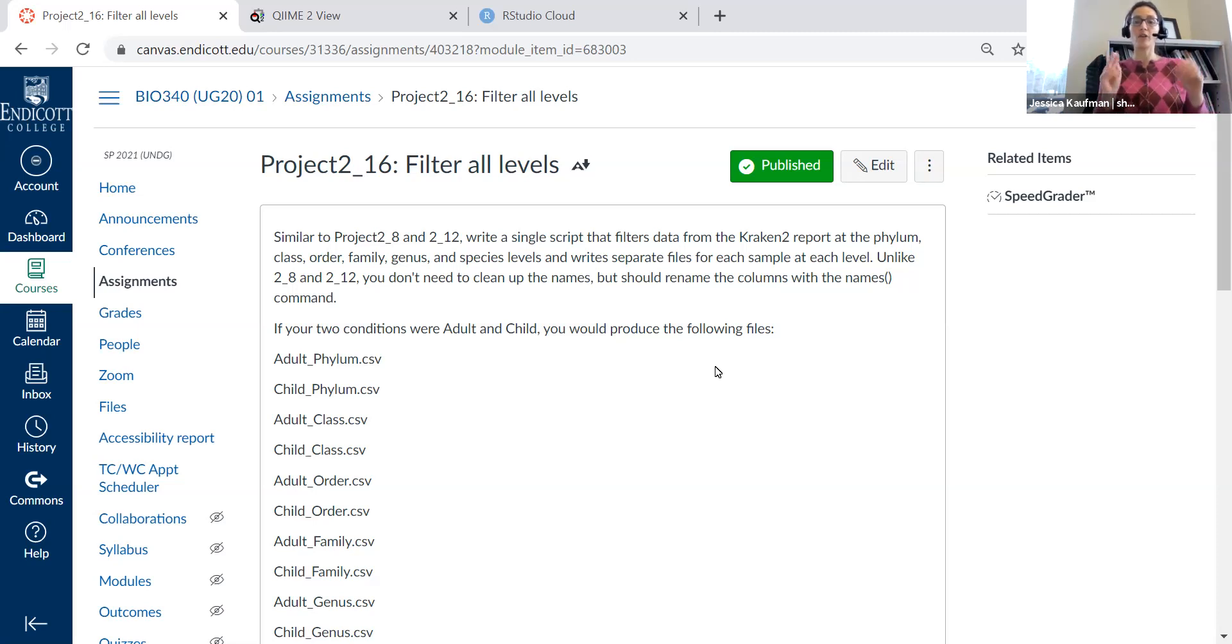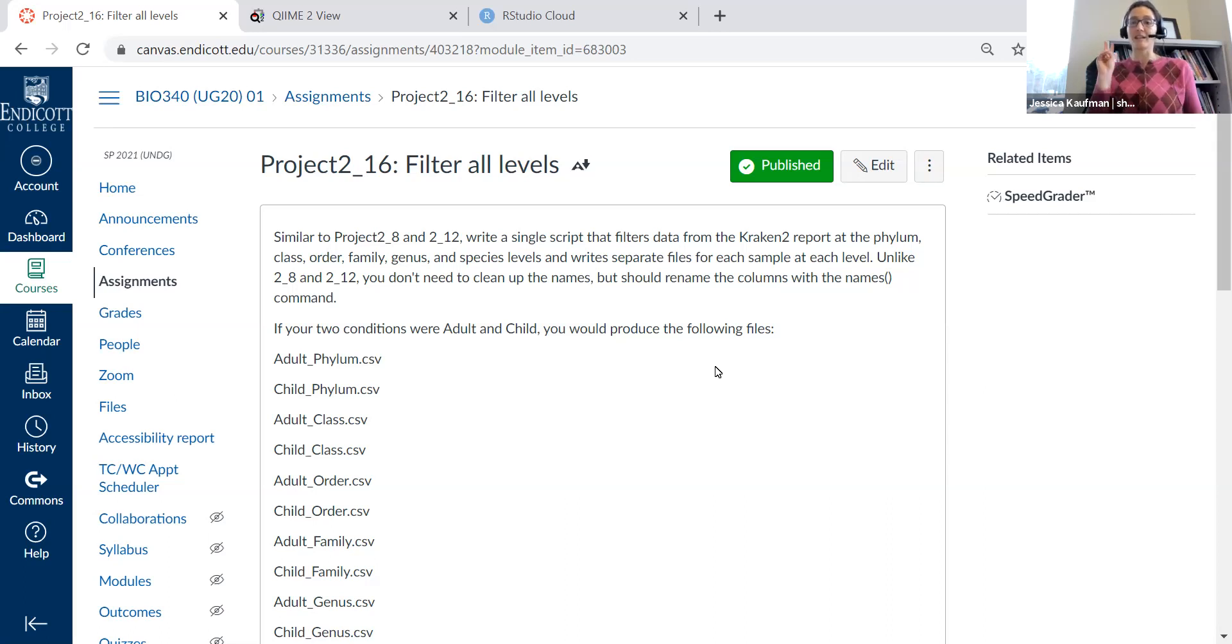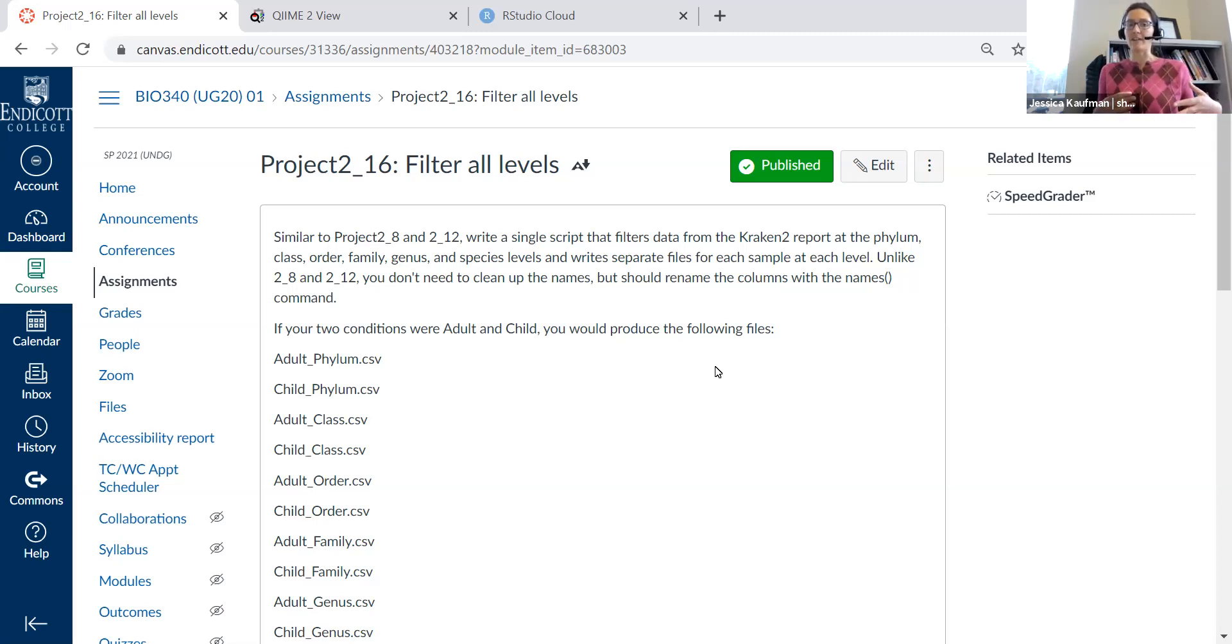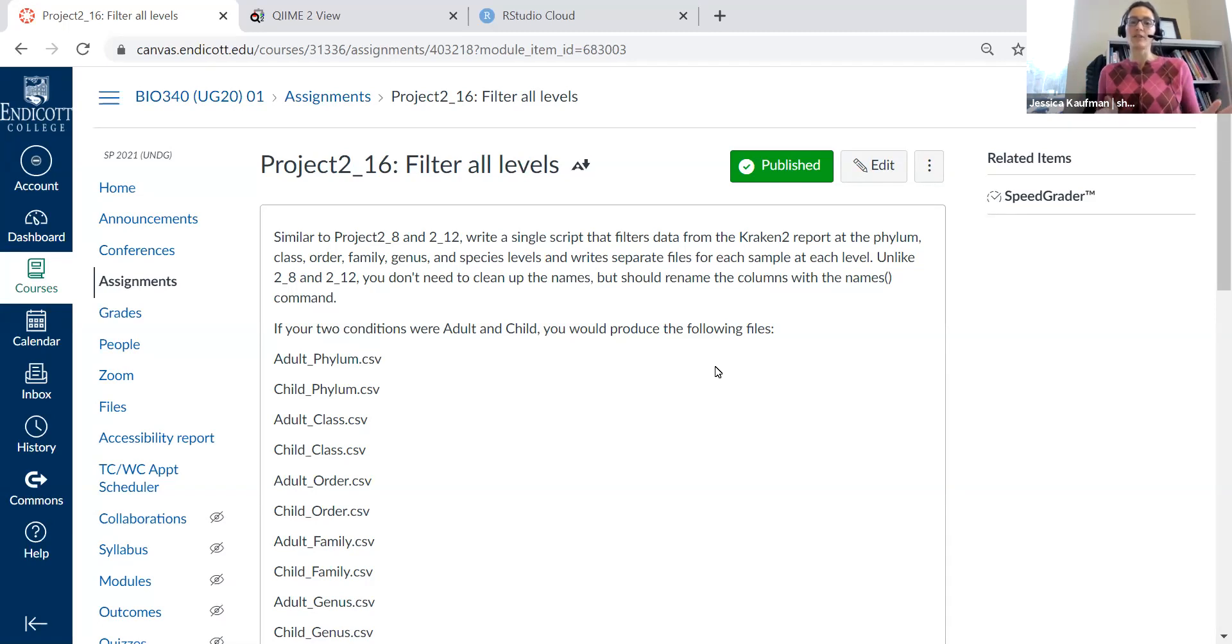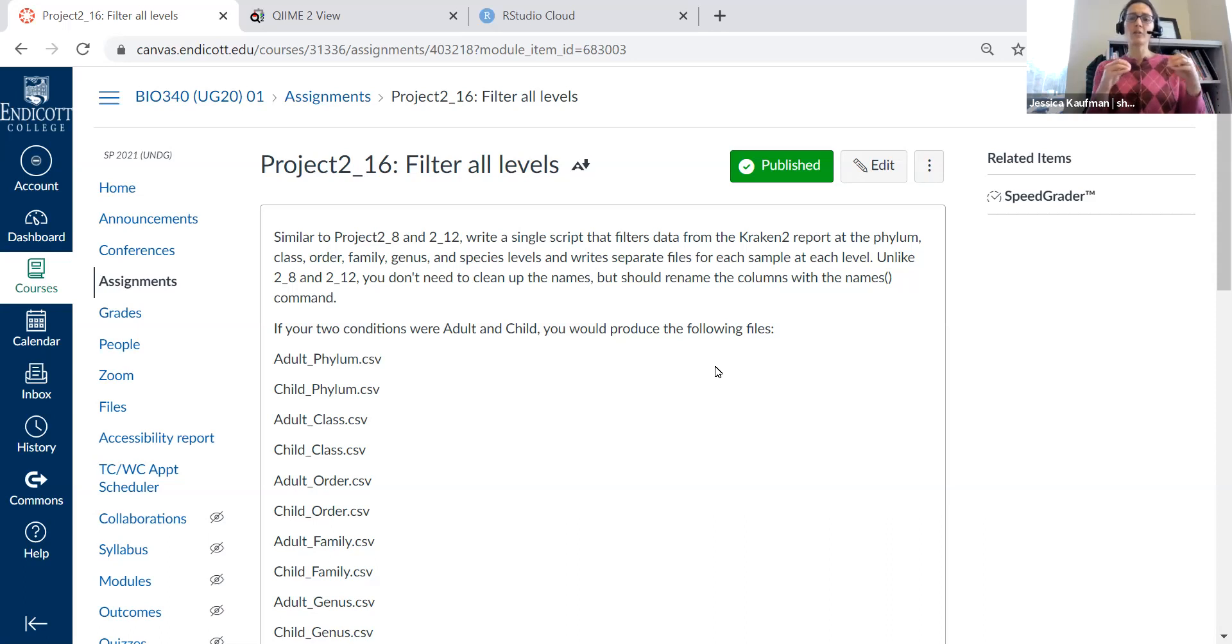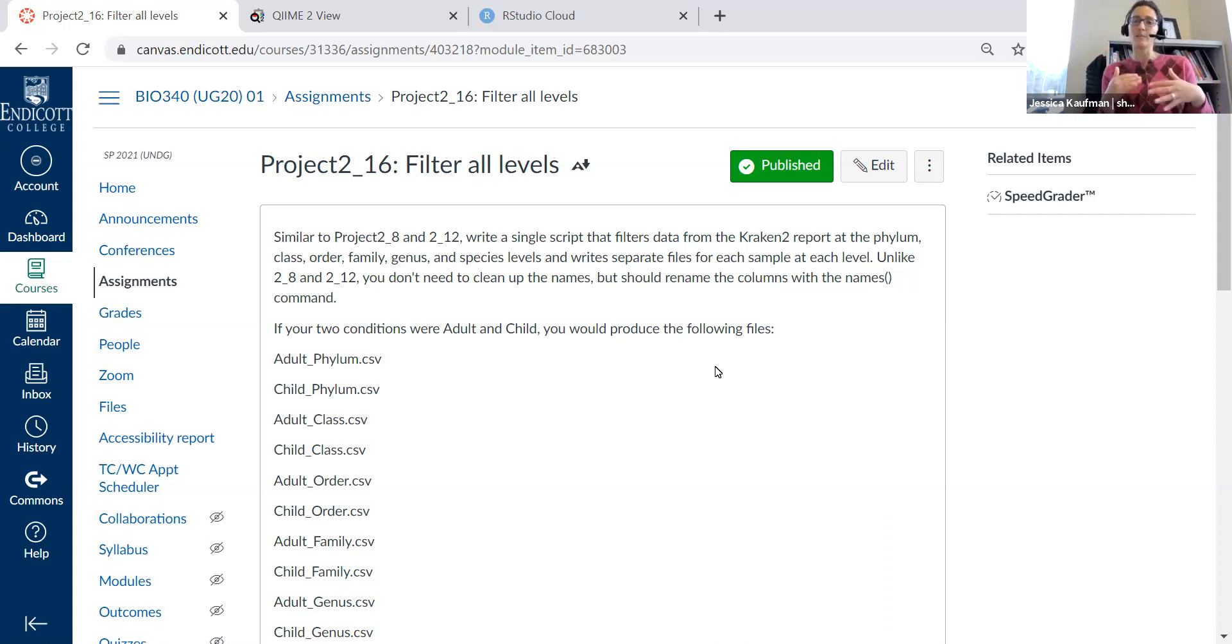So if you have two samples, every level of classification is going to make two files. If I had my adult and child samples, I would have adult phylum and child phylum as two separate files. And I don't need to clean up the species names or the genus names or the family names. I'm going to leave them with their longer versions, but I just want you to be able to see how to take the data and split it into these separate parts.